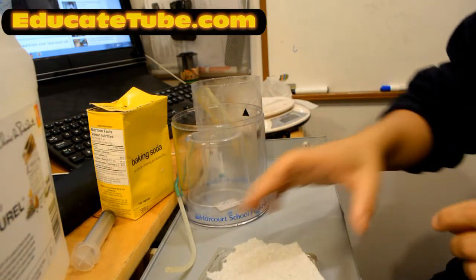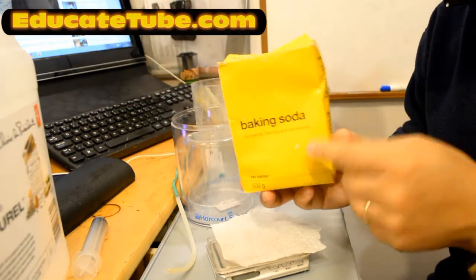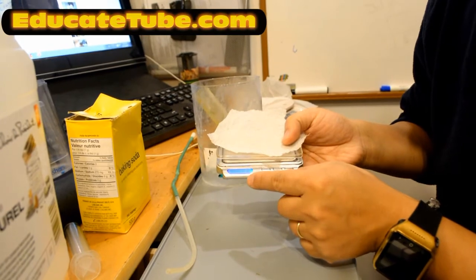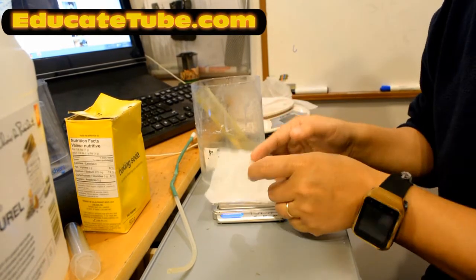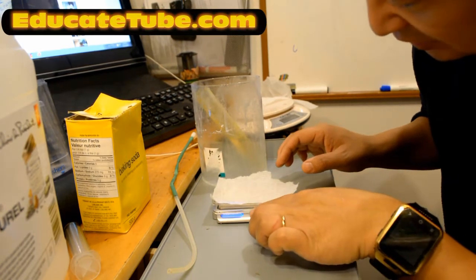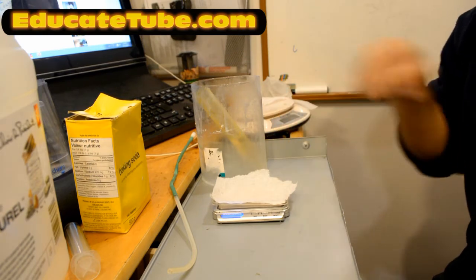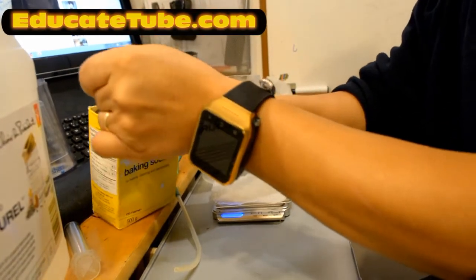Right. Next thing I want to do is take 1 gram of sodium bicarbonate. I don't know if you can see or not, this is a digital scale. Its measurement is accurate to 0.1 grams. So I'm going to put 1 gram into this tissue paper. Now I'm going to set it to 0. We'll press tare. There we go. And I'm going to pour 1 gram into here. I just need a spoon or some kind of spatula to pour in here. Let's do that. Okay, let's take 1 gram of sodium bicarbonate.